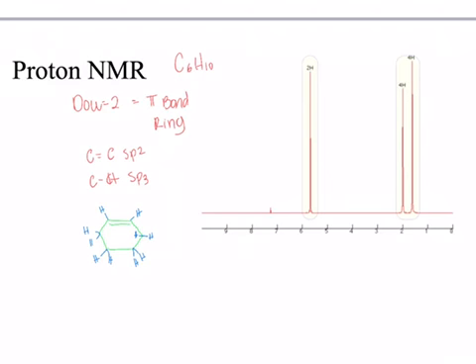Now that we have added the hydrogens, we are going to look at the splitting of this image. It happens that for C6H10, when we zoom in on the image, there's no clear splitting that matches our integration. That means that this compound does not follow the N+1 rule.